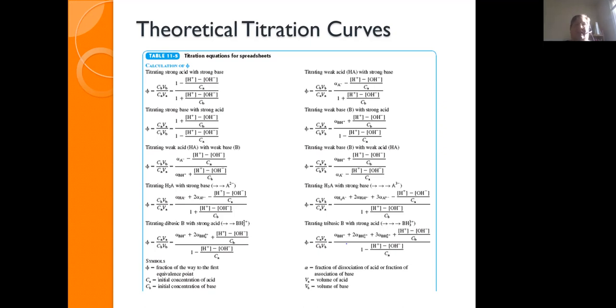It should not take you more than 45 minutes to do the entire experiment. I have been hearing about students taking 3 hours. Each of these titrations takes less than 5 minutes to run. So even with rinsing the lines, it should not take you that long. I will also mention that if the pH check is off, it doesn't really matter because there is absolutely no accuracy grading with these titration curves. All that matters is that the shape of the graph looks correct.